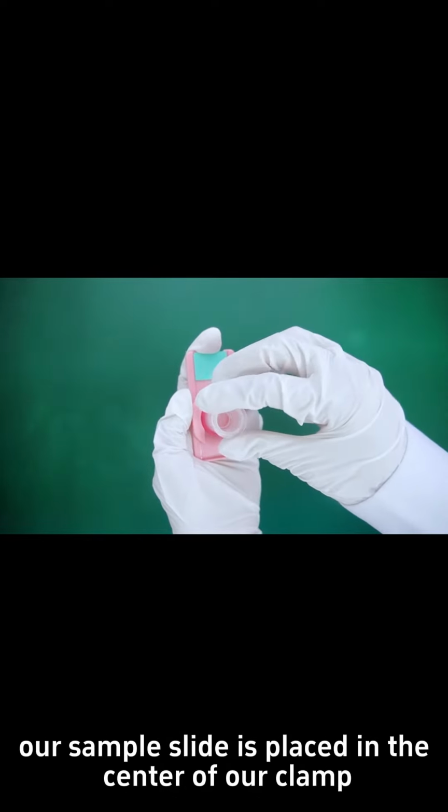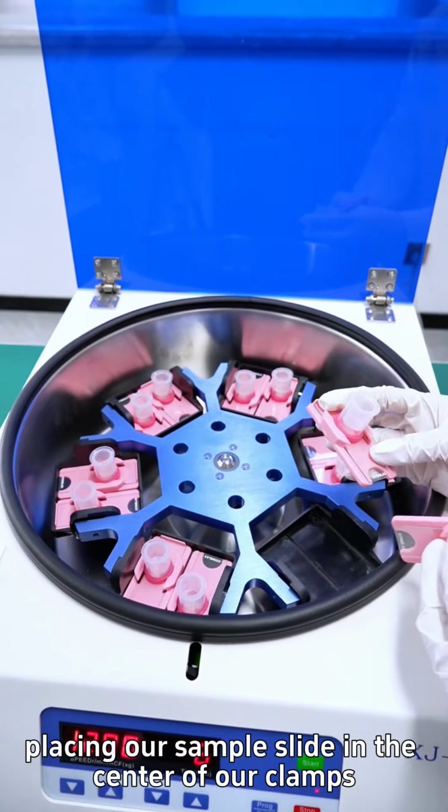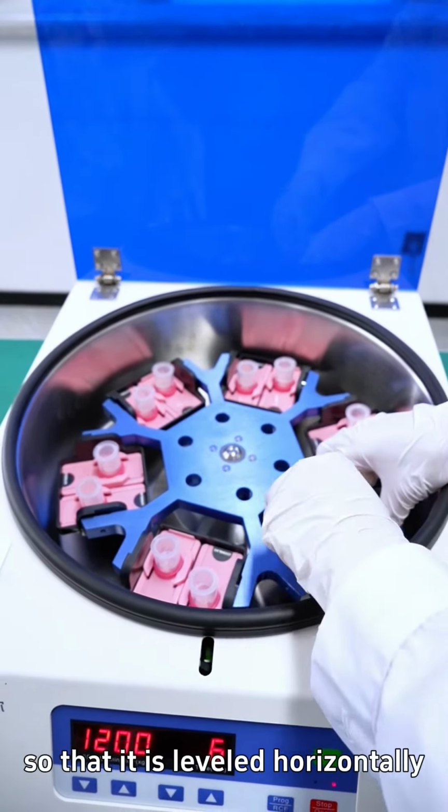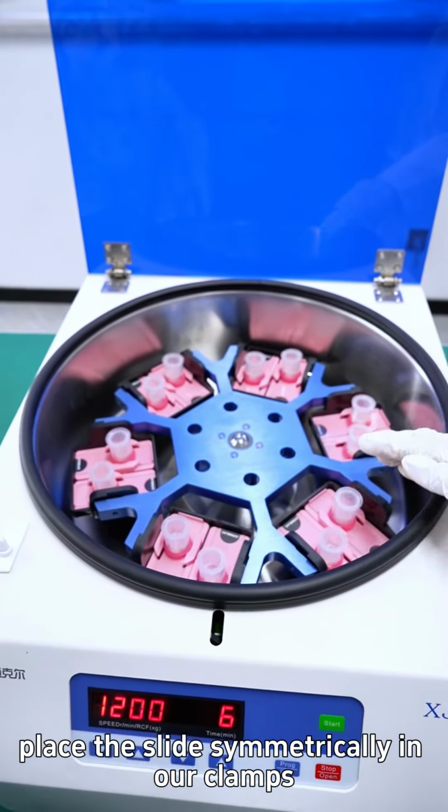Our sample slide is placed in the center of our clamp. After placing our sample slide in the center of our clamps, we place it in the opposite direction, so that it is leveled horizontally. Place the slide symmetrically in our clamps.